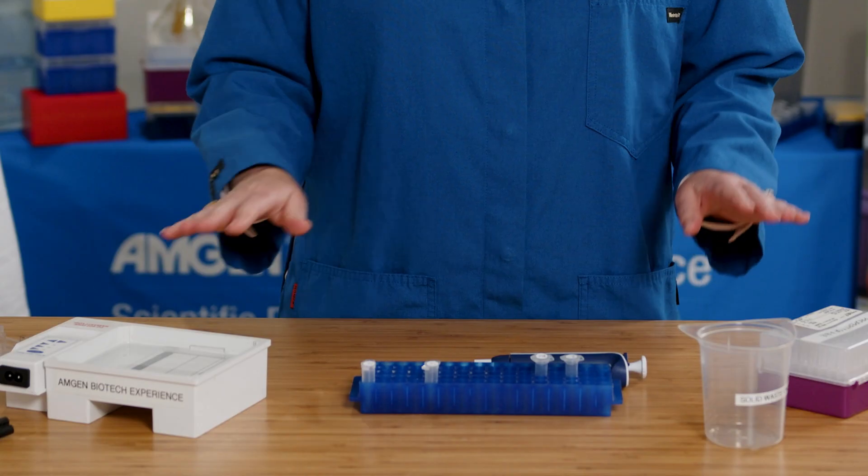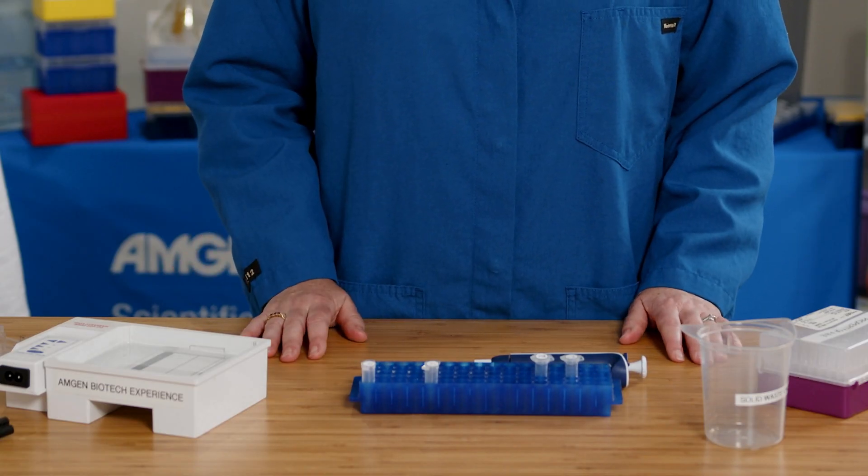Here are the reagents and the equipment that I'll be using in lab 4a. Notice that they are similar to what we used in lab 1.2, except this time we'll be using samples that contain DNA and not just dyes.